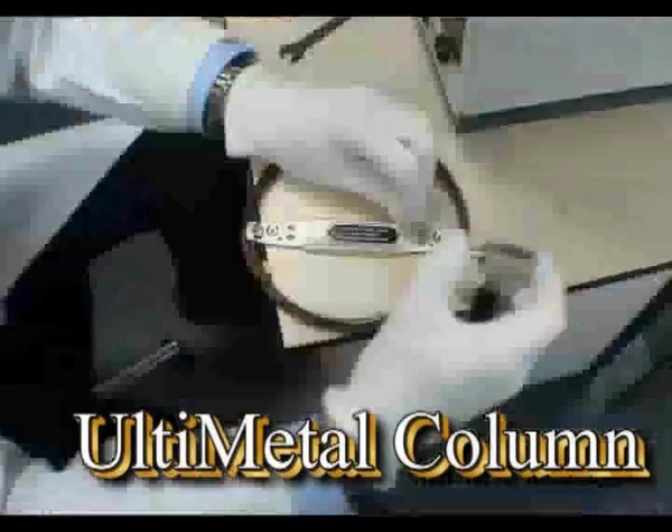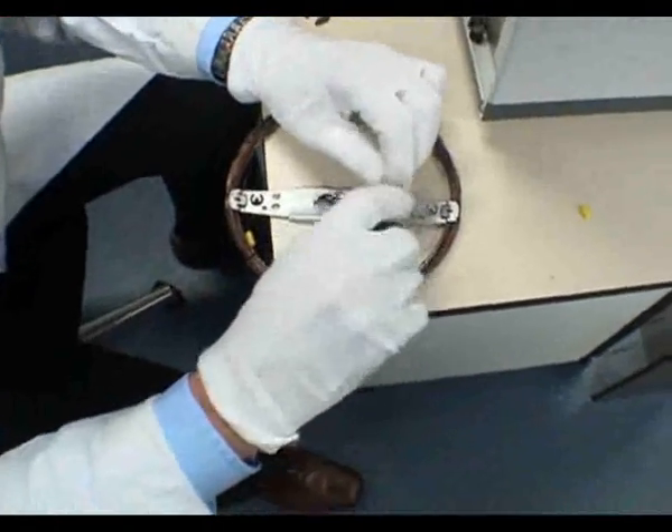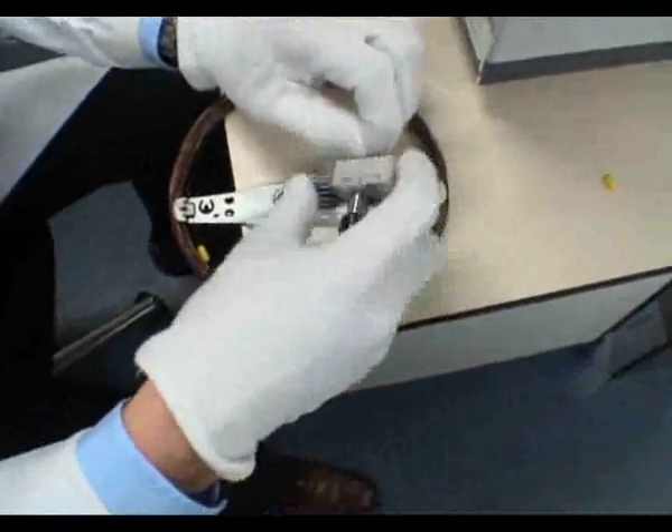But does it still work? We cut the ends of the column using a special Ultimetal column cutter and installed it in one of our GCs.